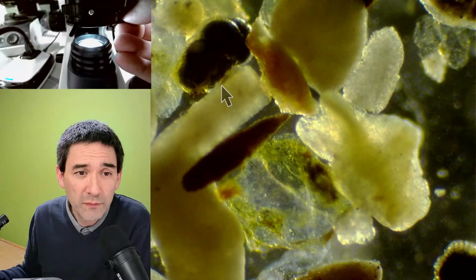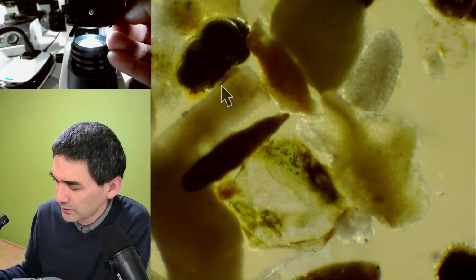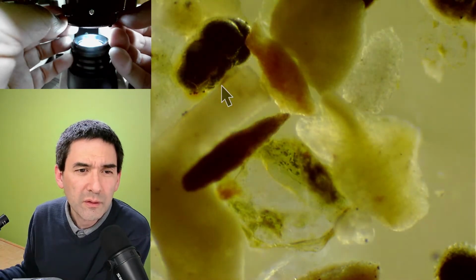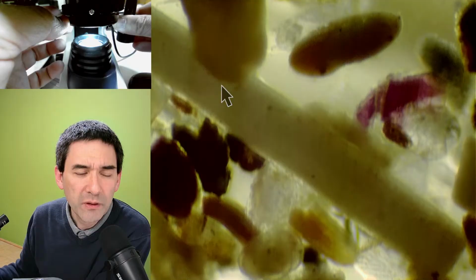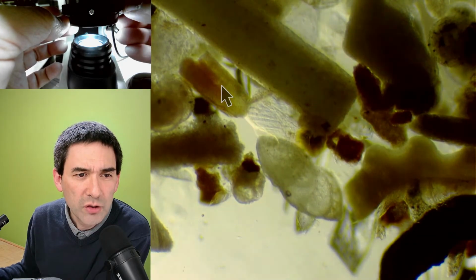So I don't know if it's a little bit like dark field. Not all samples are equally suitable. The sample seems to be fairly thick, but occasionally, yeah.